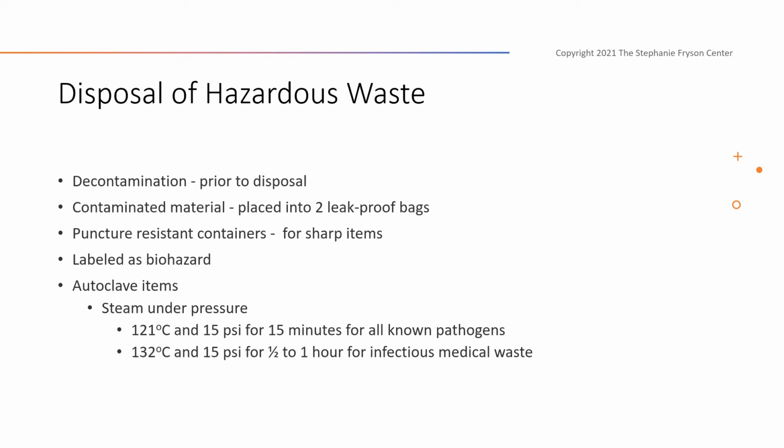Autoclave, this is a big thing. Of course, it comes up as a question on the exam. Steam under pressure. There are two options: 121 degrees at 15 psi, 15 minutes for all known pathogens, and then 132 degrees, 15 psi for a half hour to 1 hour for infectious medical waste, which normally comes from like the OR room.